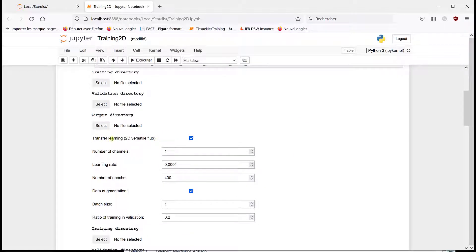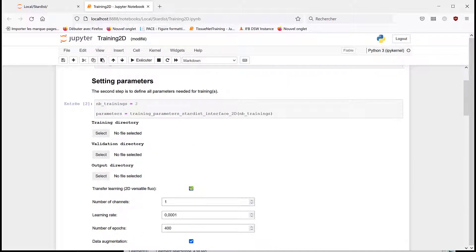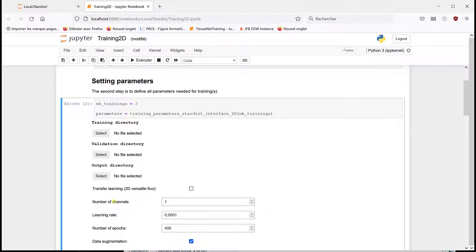And the transfer learning is actually based on the model I just showed you, the pre-trained model, versatile. So we're going to try without a transfer learning and with transfer learning.